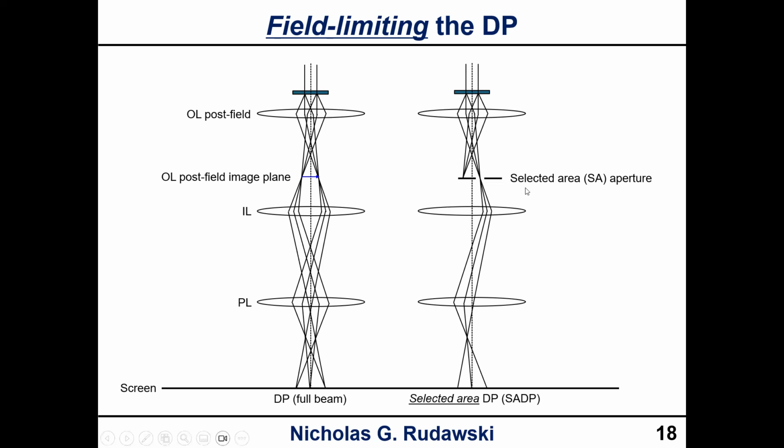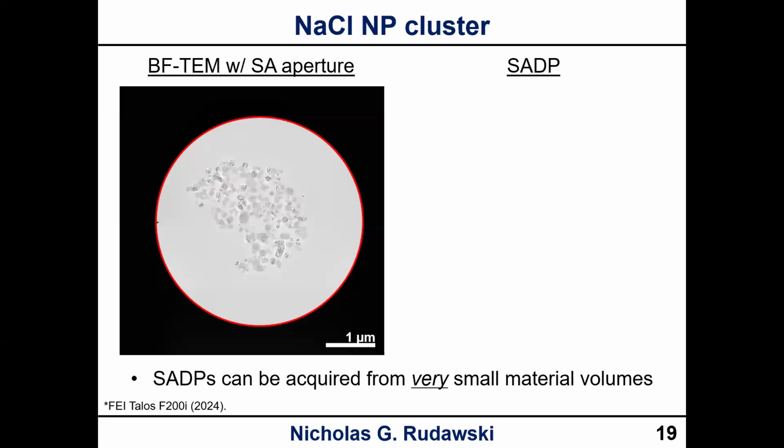And now, obviously, the reason we have to put the aperture here, we can't put it here at the sample plane, obviously, is because there's a sample. So we put it at a conjugate plane, which is the objective lens image plane instead, and we can accomplish basically the same result. Okay, so there's your contributing area, just as I indicated.